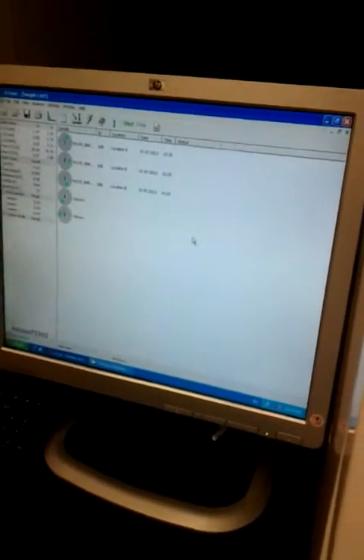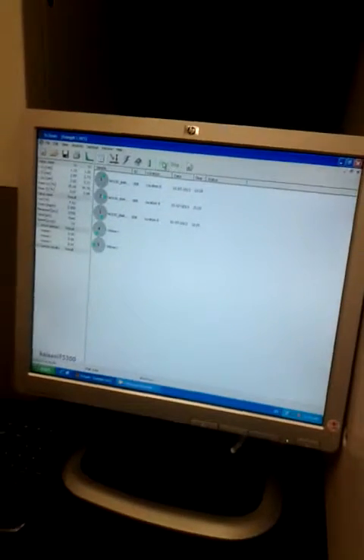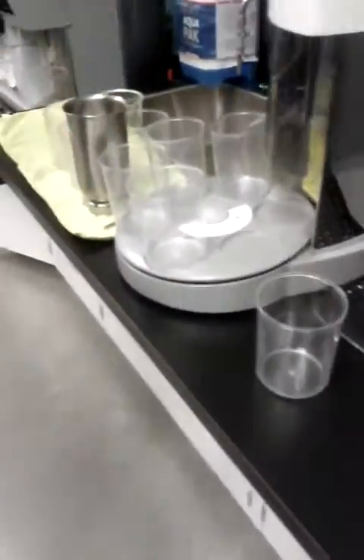And what else? So you just run, start. If sometimes your frequency is too high, it's going to stop, as I told you, and then an error message will appear, and you just have to click on OK. You restart the disk. Okay. So let's do a test. I'm going to use a sample of mine.